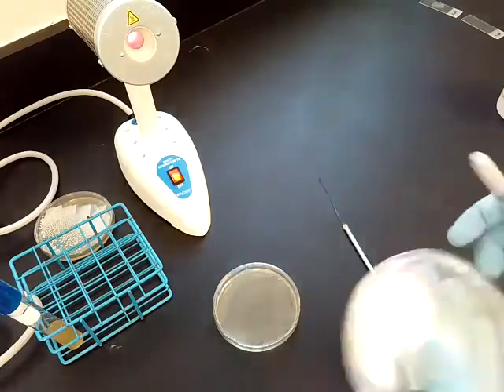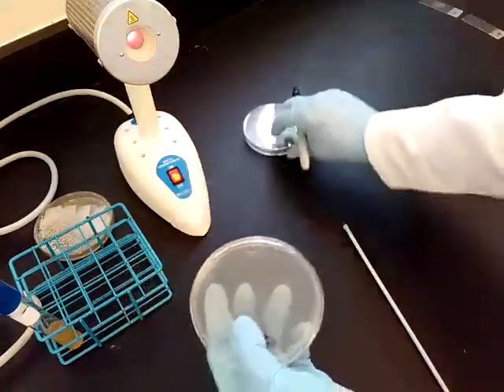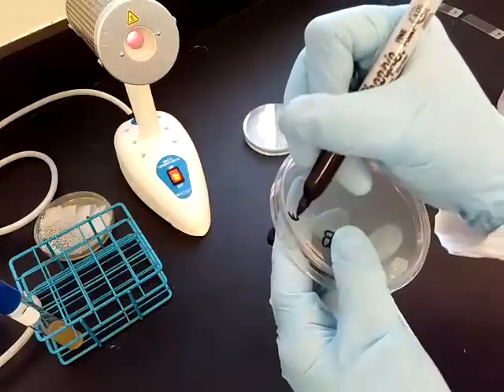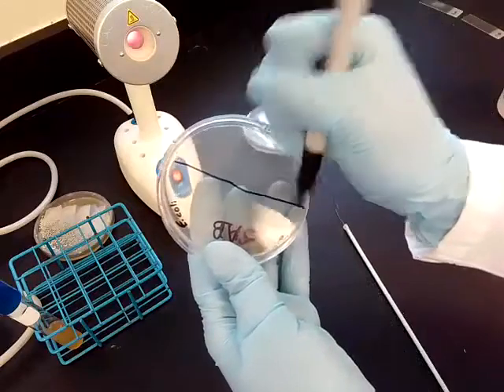The other way to do it is with the quadrant method. So I'm going to show that method now. You again want to start by labeling your plate, and then you can break the plate down into visible quadrants.